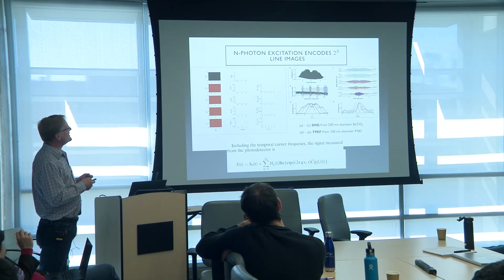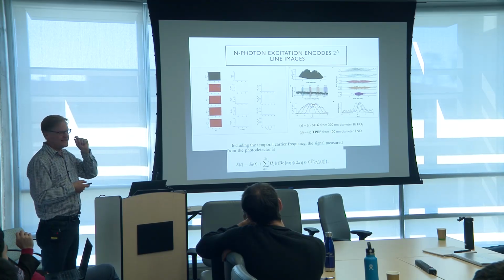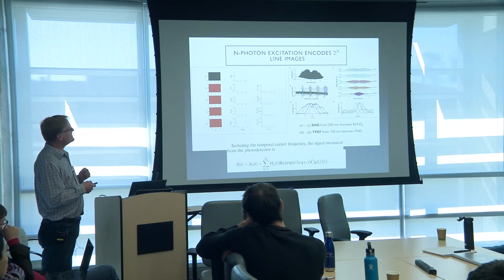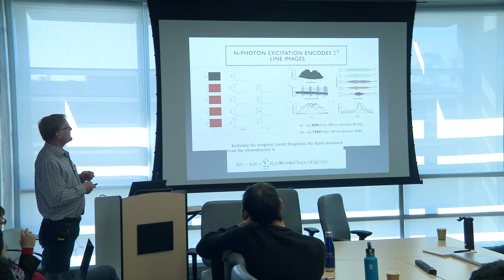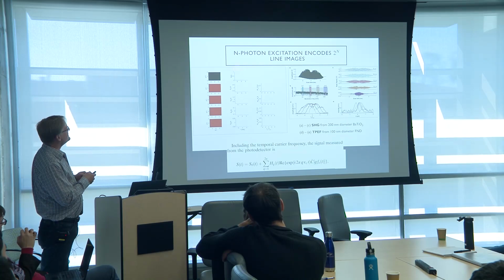Now I can actually see, in this case, I think it was a 100 nanometer fluorescent nanodiamond, and we're going to be able to measure the point spread function. And here is the MTF of the system. We've done it multiple times with multiple different modalities. And so this is your net signal.